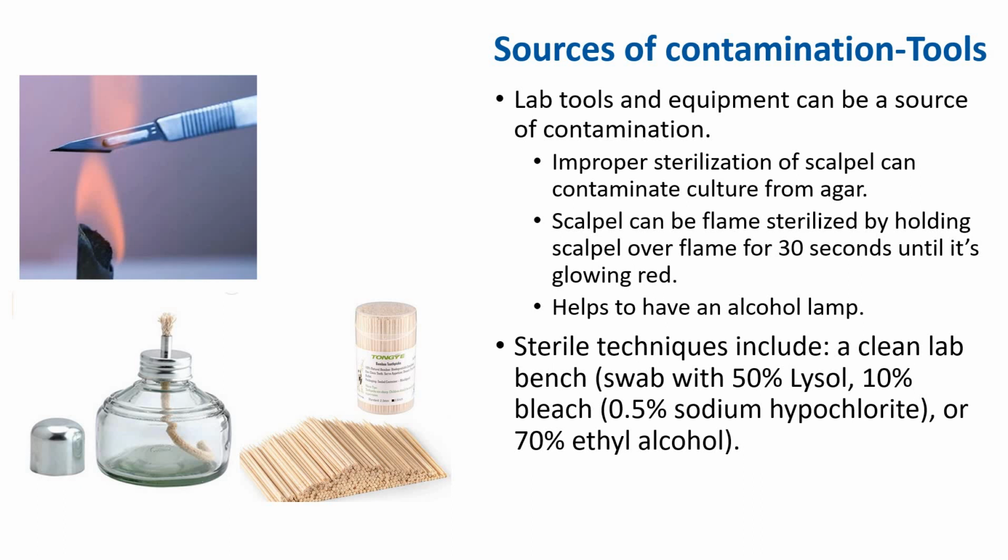Another source of contamination is tools. When dealing with agar or transferring culture, it is common to pass contamination between cultures if you are not properly sterilizing your scalpel. A scalpel can be flame sterilized by holding it over a flame for 30 seconds until it's glowing red. This will help if you have an alcohol lamp at hand. Alternatively, you can use a sterilized toothpick. I've used single-use sterilized toothpicks to transfer cultures.